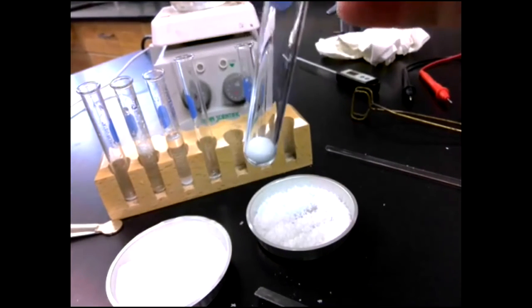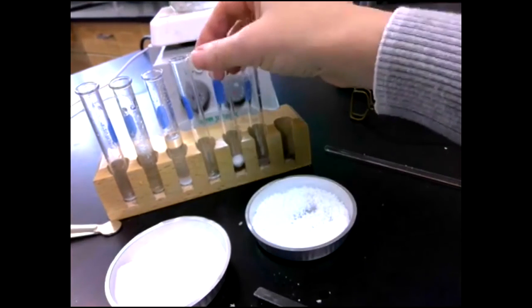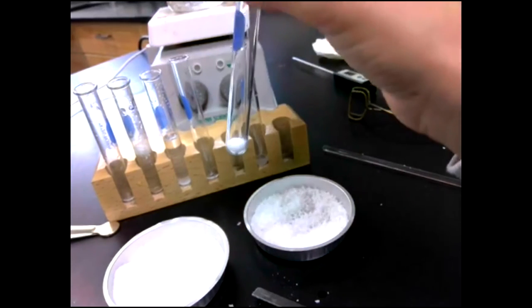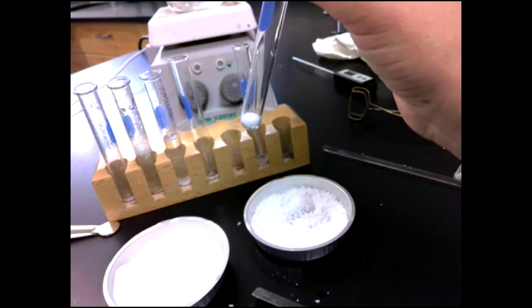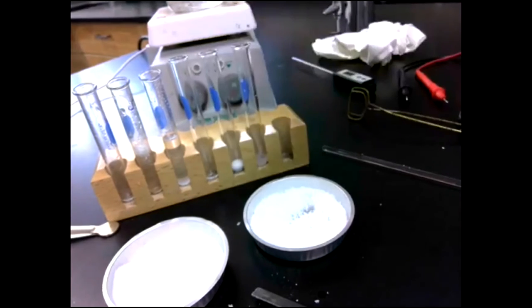So do we just write like NA or just high melting? Right, high melting. And you could make a note that we know that it melts above 100. I can tell you that it melts way above 100. It's like hundreds of degrees. We don't have any way to test that here.